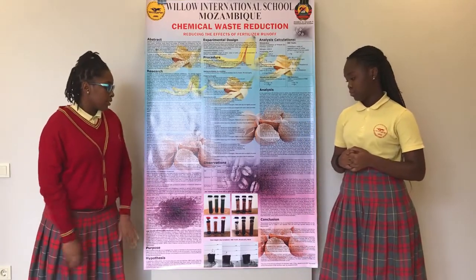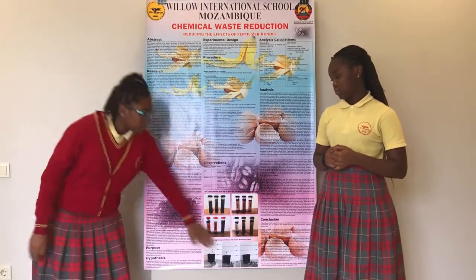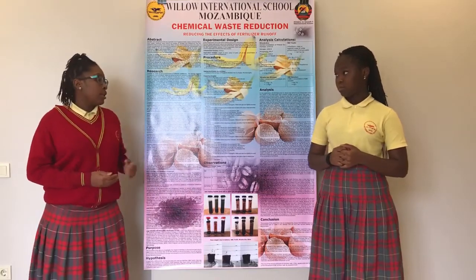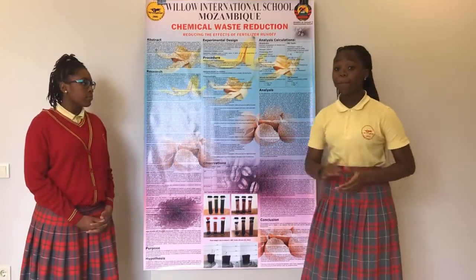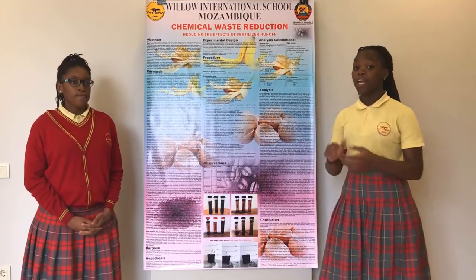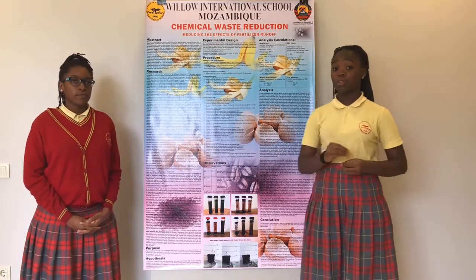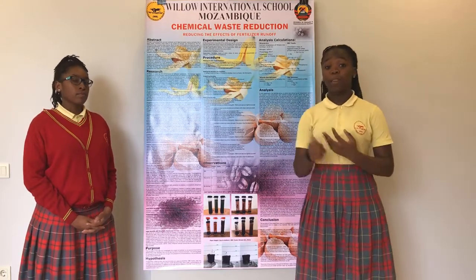Lastly, we observed the set with no fertilizer. The height of the plant was 7 centimeters, the pH of the soil was 7, and the nitrogen and the phosphorus levels were very low. By taking masses of the eggshells, coffee grounds, and banana peels, it was possible to determine the concentrations of the 3 most essential nutrients for plant growth: nitrogen, phosphorus, and potassium.